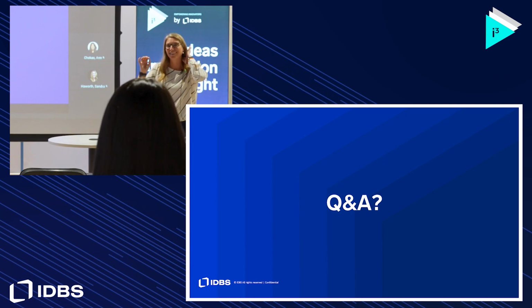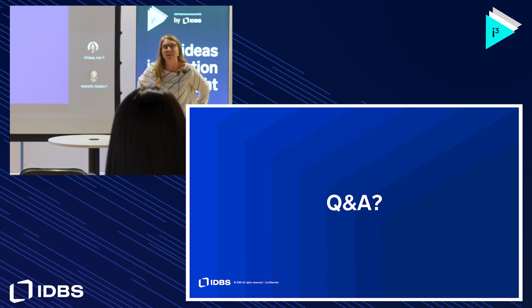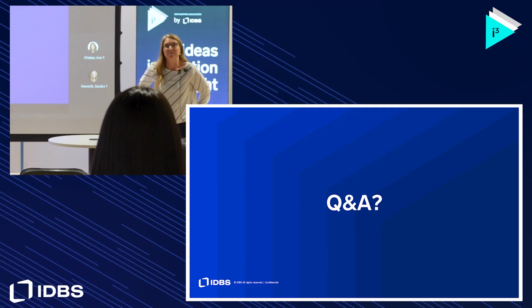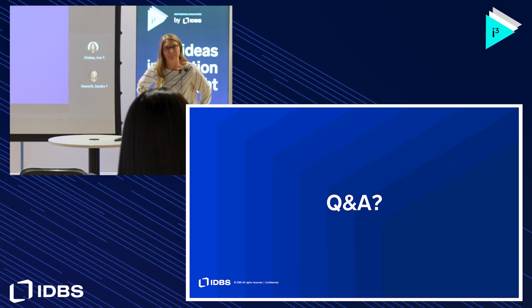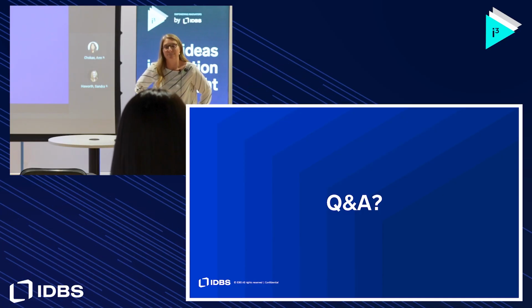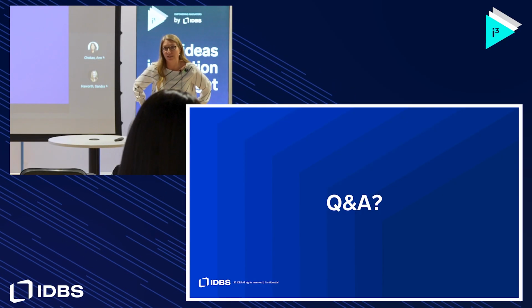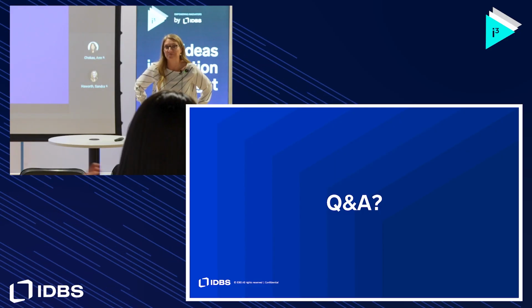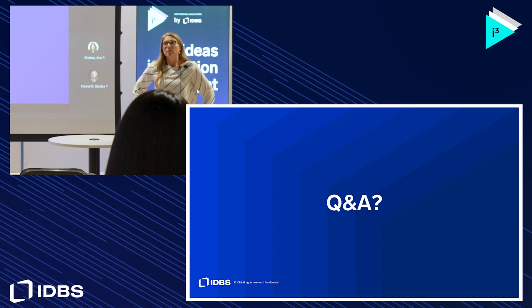Thanks, April, for the presentation. I had a question about the integration that you have between Watson LIMS and ELN. If data is changed in Watson after it's been queried into an ELN spreadsheet, how do you manage that? You have to go back into the experiment and rerun the data link. Is there a process for them to know that they need to do that, or how does that work, like if it might get missed?